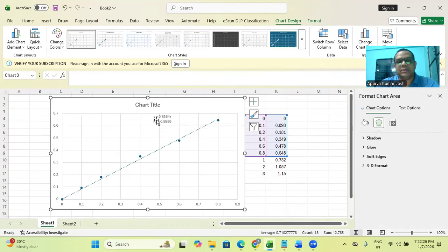You can look at this graph as y equals mx, and if you can recall, or refer to some reference literature, you will realize that the m value, the number shown here, is the slope of the line. The slope tells you how y varies in relation to x. Now, that is very important.